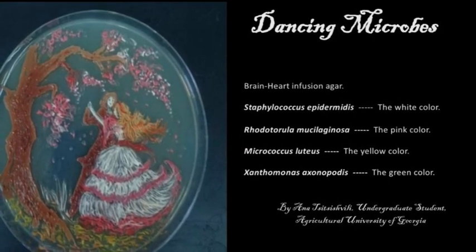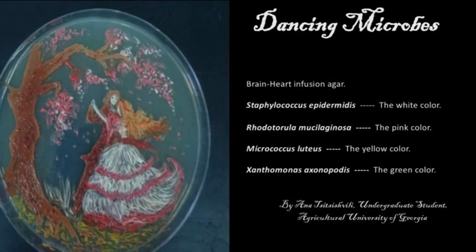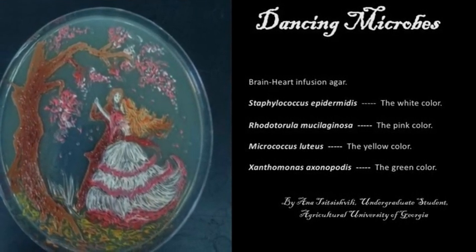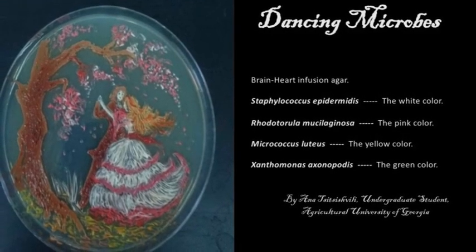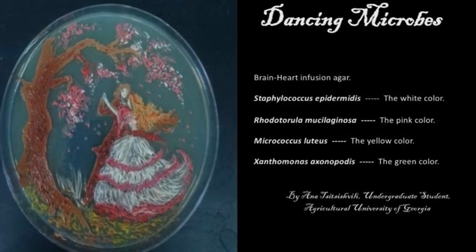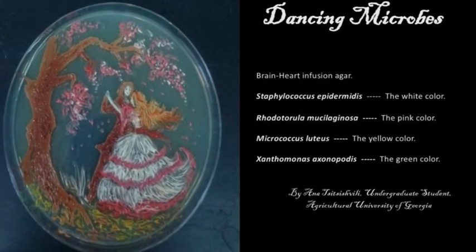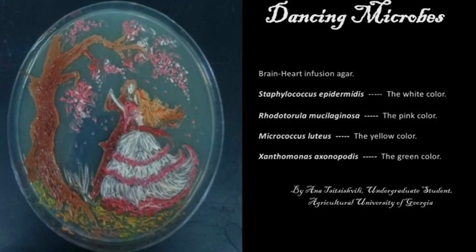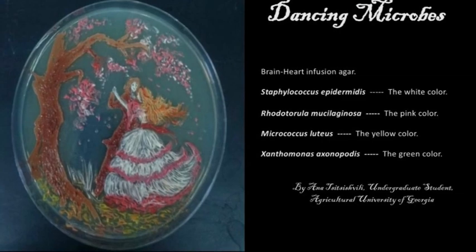Dancing Microbes. For this painting, a brain heart infusion Agar was used. The white color on the face and the dress of the girl and the boy is Staphylococcus epidermidis. The pink color of the girl's dress and the tree flowers is made by Rothia. The yellow color of the lady's hair is Micrococcus and the green color is Pseudomonas.